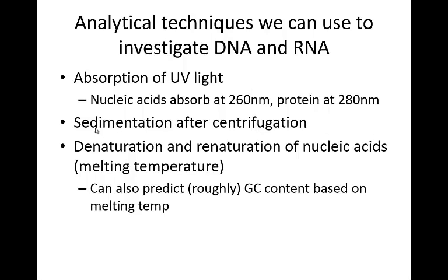One of the common ways that this sedimentation is used is through cesium chloride purification, and that's one of the things I used a lot when I was a graduate student. So when you have cesium chloride and your mixture of DNA, when you spin it at very, very high speeds, we're talking about like 40,000 revolutions per minute, you can get a very clear, distinct band of your DNA. And you can get several other bands of other things that you may or may not want. You can just use a needle, you can go in, you can pull out that particular band of the DNA. And it'd be very, very pure DNA from this process.